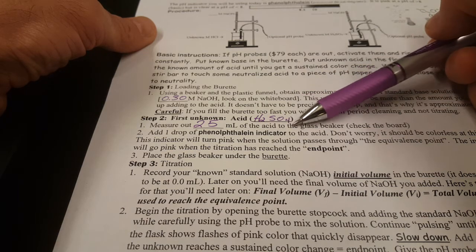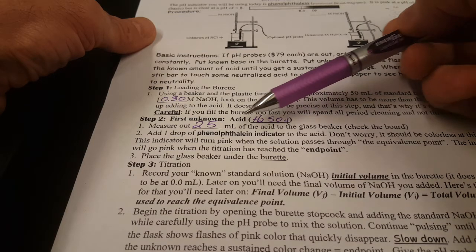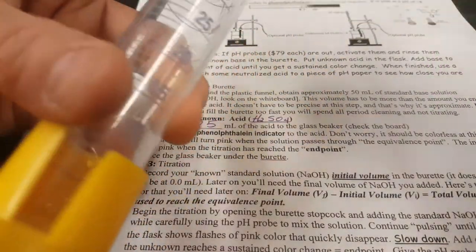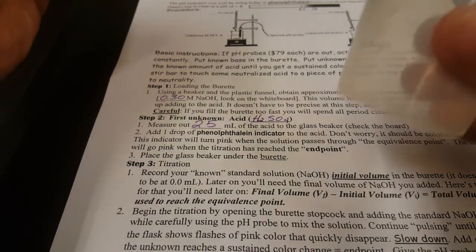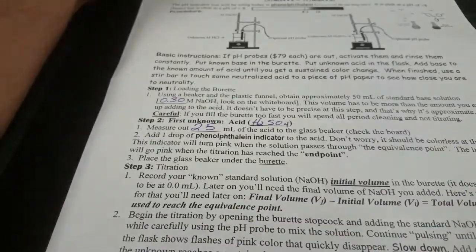And the acid I'm going to demonstrate in this video, since it is diprotic, is the sulfuric acid. And you're going to measure out 25 milliliters. Your graduated cylinder is what you're going to measure it in. Remember, the cup is for the base, and the graduated cylinder and beaker are for your acid.